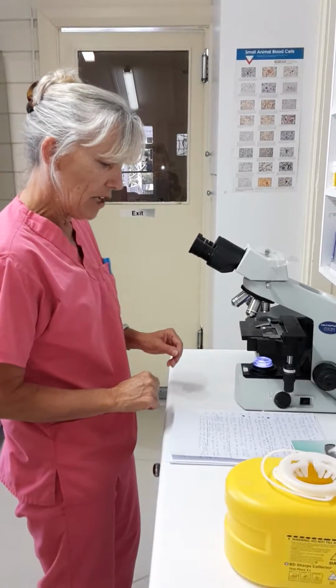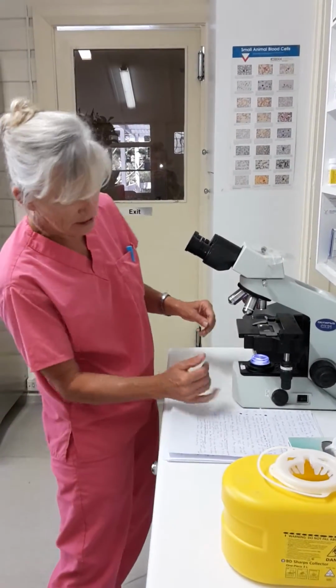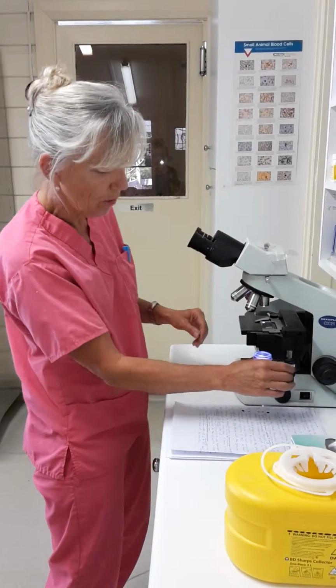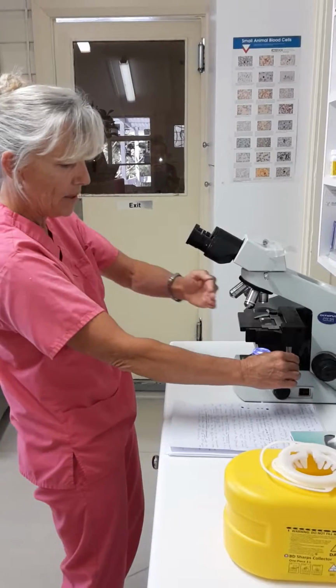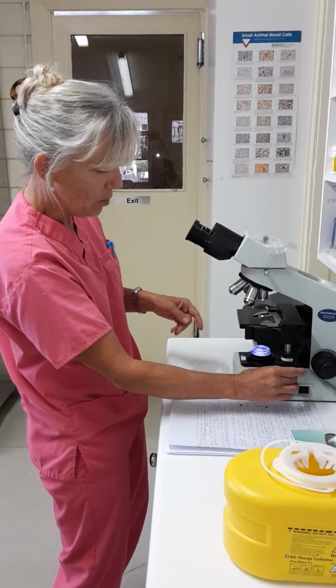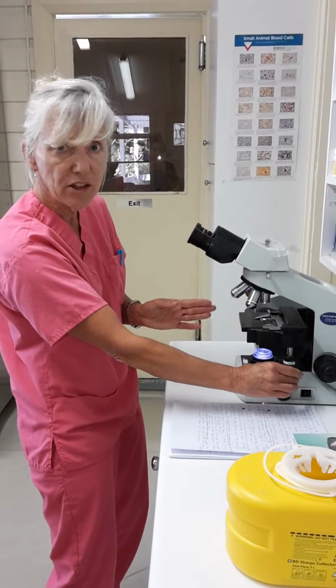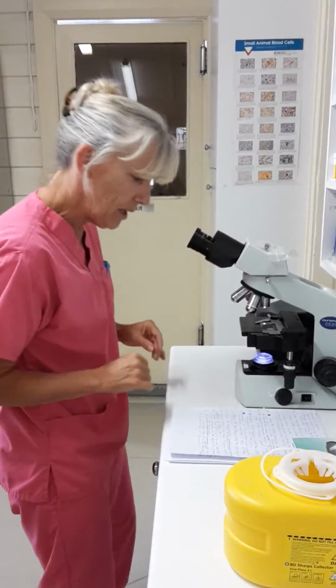We then move the stage via the translation knob so that the specimen is in view. This is the translation knob here, and the larger one is going to move our slide up and down the stage, and the smaller one at the bottom is going to move it from side to side so that we can get to the edge of our specimen. Having a look at that is nice.